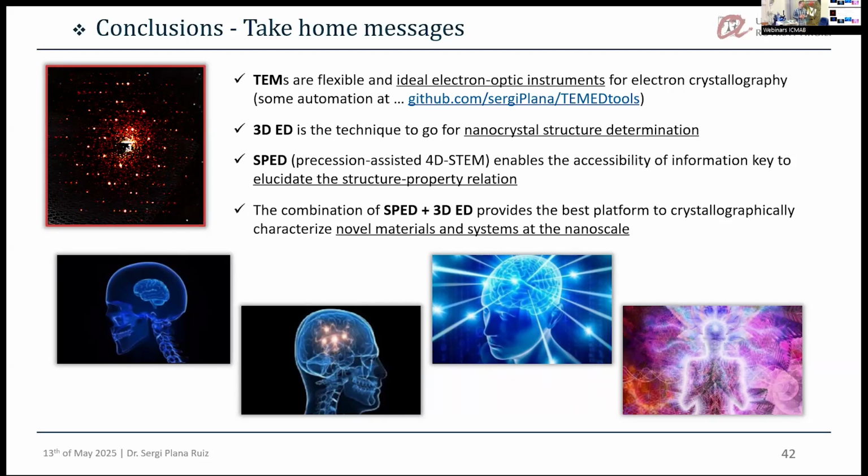In the worst case scenarios, you can also get data from several crystals, and you can merge all of this electron diffraction data together in order to increase the completeness. And this helps in order to solve the structures. But the key point is the introduction of direct detectors that allow you to work at very, very low electron doses with significant data out of it. At that time, one possibility was to look for zones that were not damaged, no?